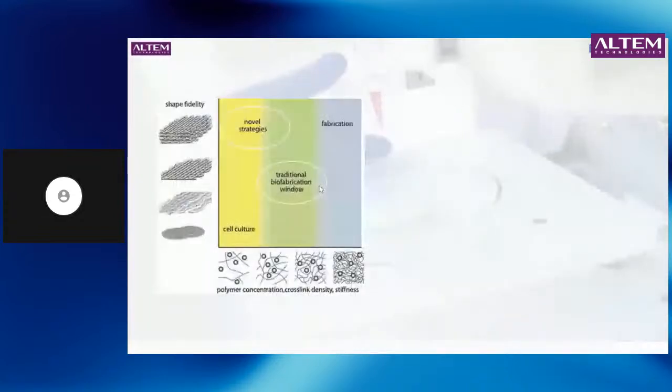Then comes the bioprintability. So bioprintability becomes one point where you have shape fidelity, as well as the concentration of the material, as well as the impact of this on the cell culture or the cell printing which takes part. So you will see that if you're trying to have the best amount of shape fidelity, then you might also not have the best amount of cell viability. If the material is too stiff, then it cannot print at all. But if the material has the optimum stage, then you can get good amount of cell culture.